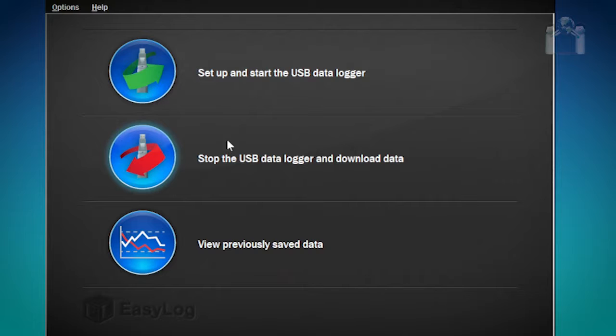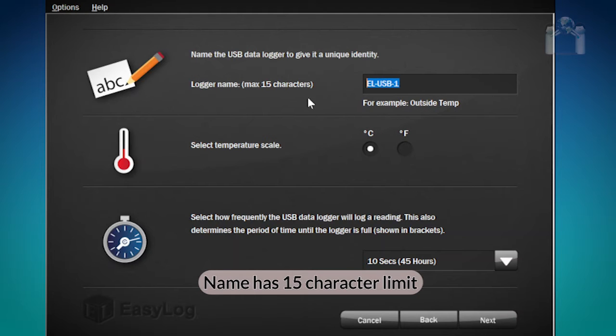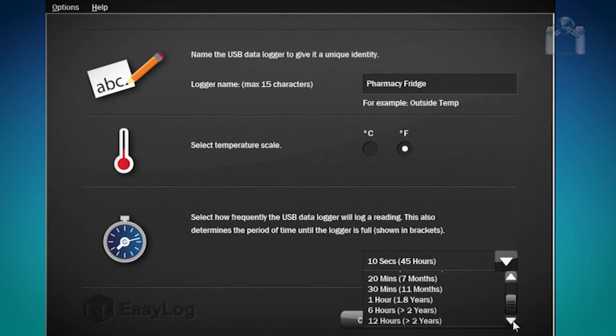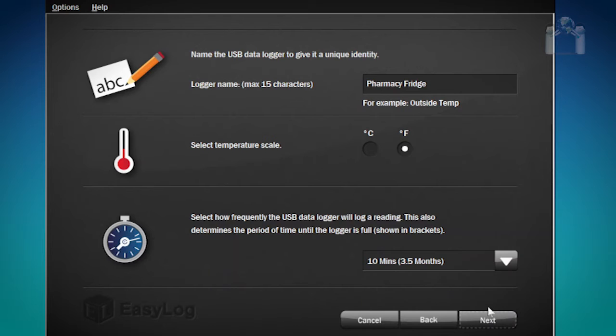After a few moments, a menu should appear. Select the first option: Set Up and Start the USB Data Logger. The first two options are very easy — give the data logger a name, and choose whether you want the temperature scale to be Fahrenheit or Celsius. I will change the name to Pharmacy Fridge and change the temperature scale to Fahrenheit. The third option is how often you want the data logger to log the temperature. The more frequent, the sooner the memory will fill up. The software conveniently shows you how long it will take to fill the logger's memory based on the frequency. Click the drop-down box and make a selection. For this demonstration, I will select 10 minutes, then click Next.